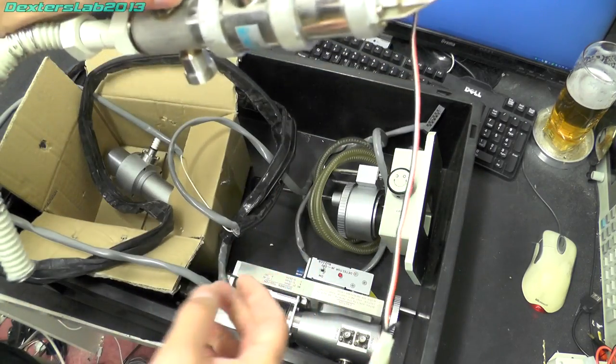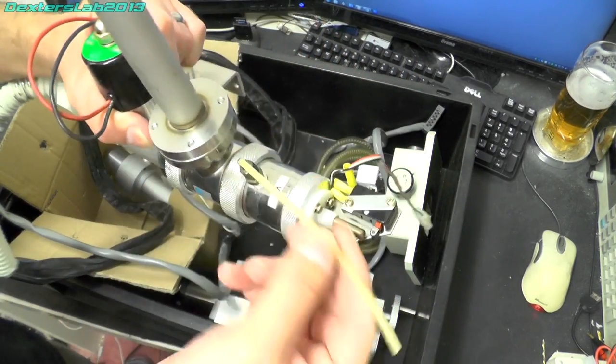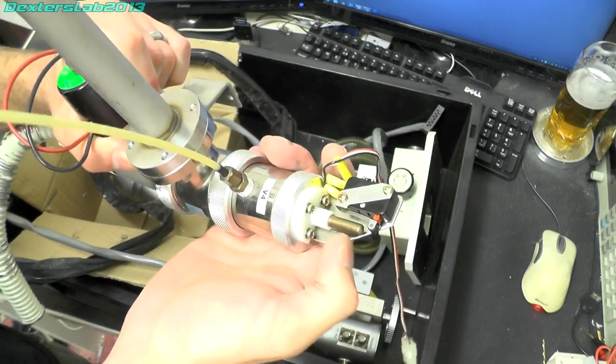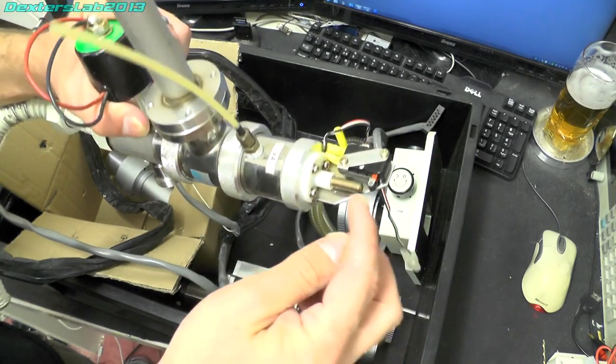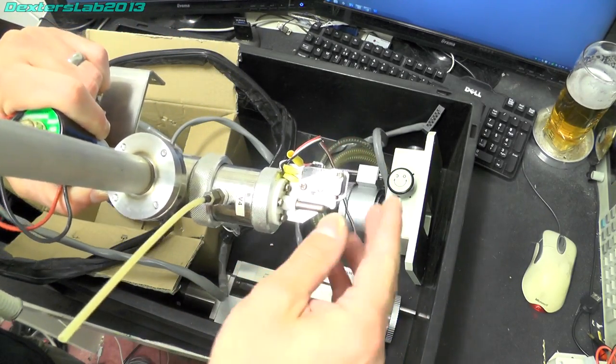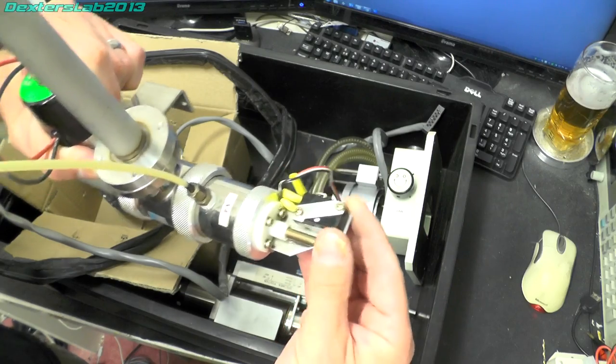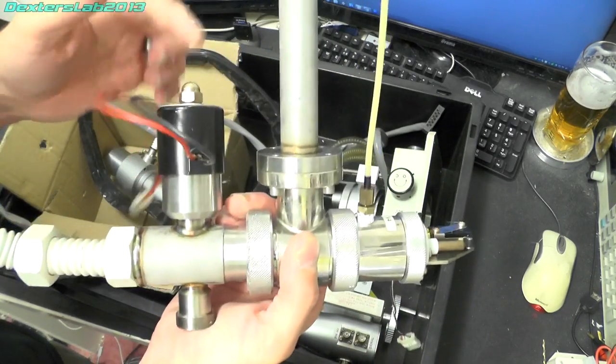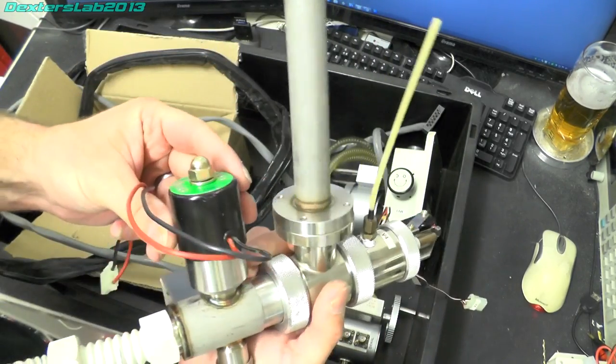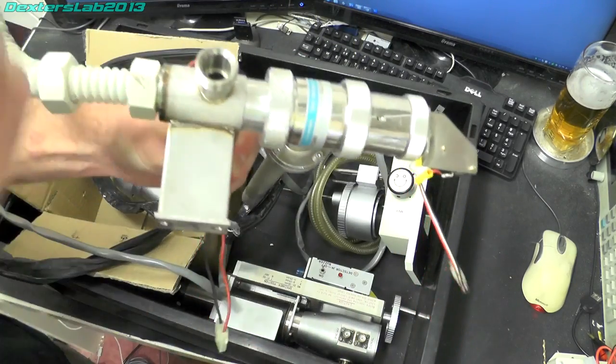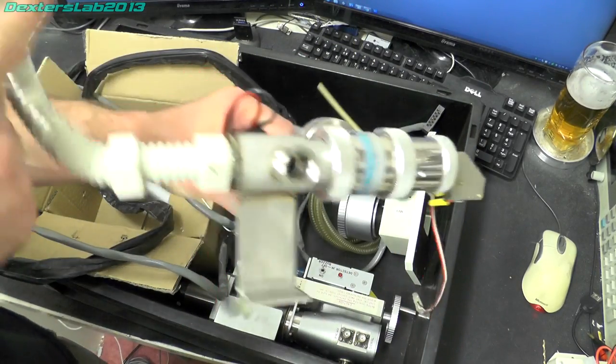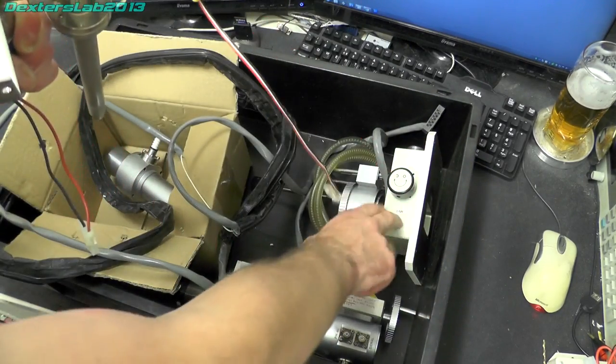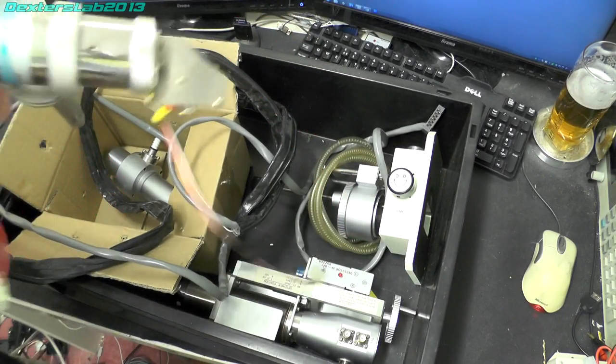So it looks like we've just got a pneumatically operated valve here, looks like that pin moves upwards and we've got a micro switch there for feedback. And there's another solenoid valve just in there and this pipe here comes from the actual exchange chamber.